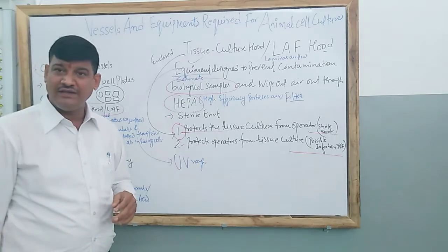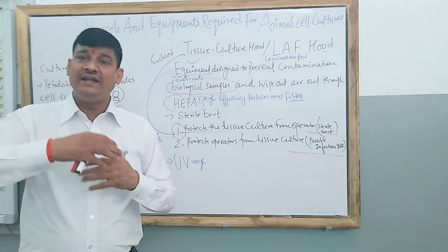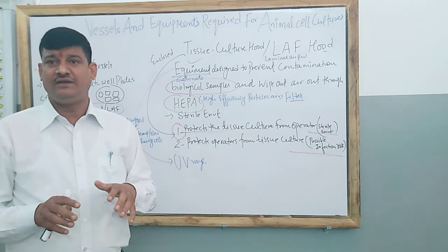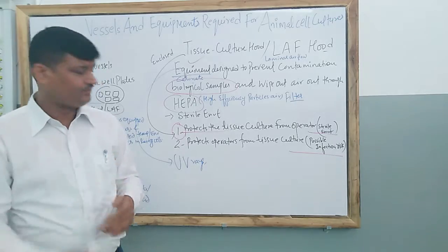What is the meaning of HEPA here? It is a high efficiency particulate air filter that continuously removes the air which is inside the cabinet. So the main purpose of this HEPA is filtering the air.